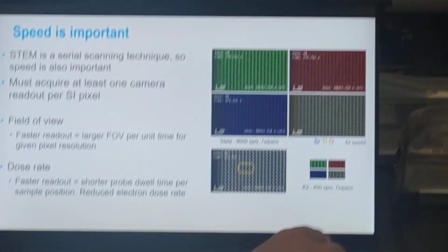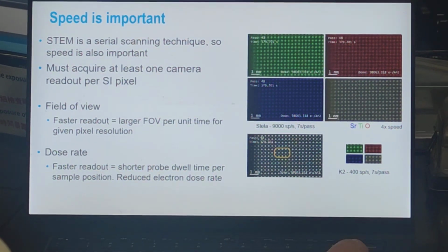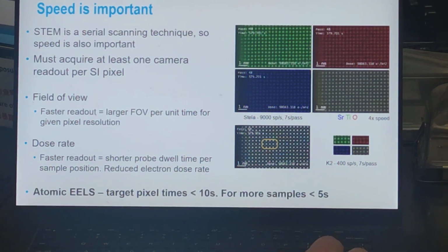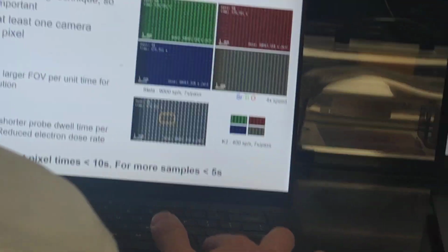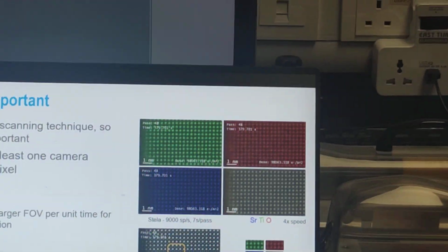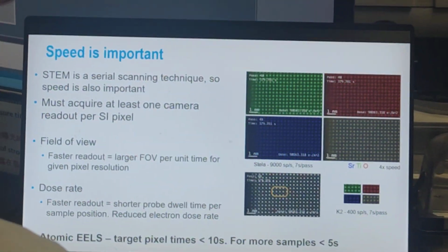Right. But even in the 4D STEM case, we have the image. It will be the same. Yeah, each image can be saved. So we need this data at each acquisition point, and for one pass. Then for another pass, we may have another image. So I'm just curious, the whole data set will be saved. The whole data set saved.